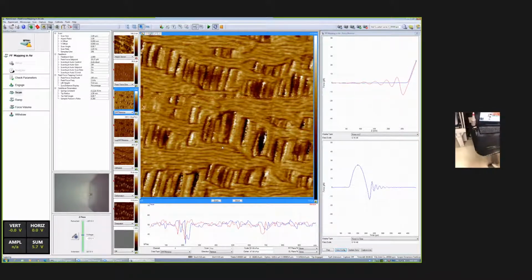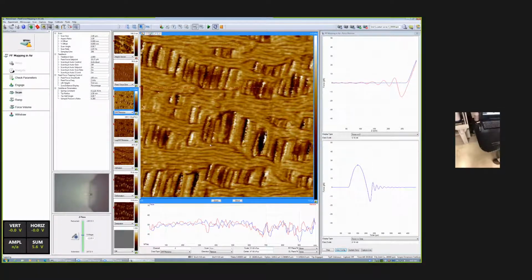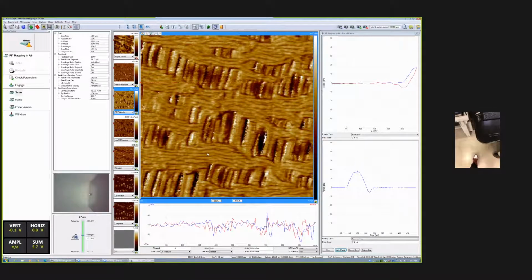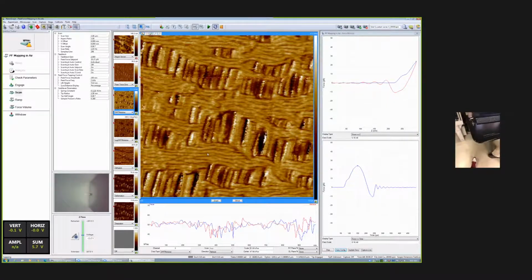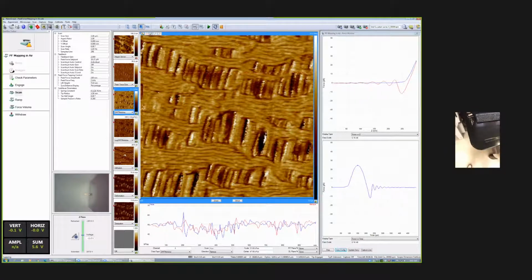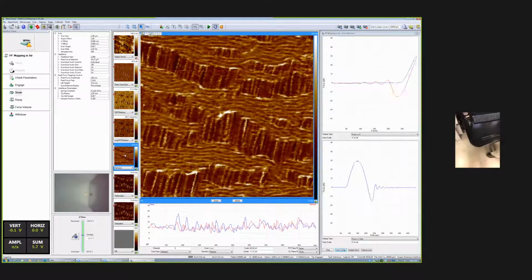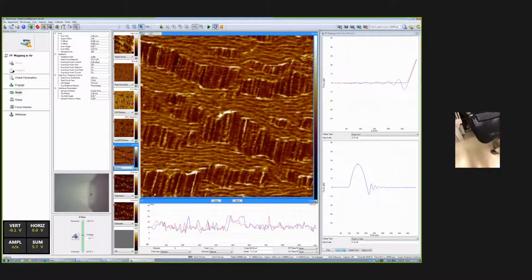If we increase the force, the sample will deform more because it's not infinitely stiff. If it's less, it would deform less. And we can now get maps of the local mechanical properties. Similarly, because we're touching it, like if you touch anything, there is some attractive force there. If we look at the adhesion channel, which is this channel, you can see that certain regions are softer versus others that are stickier.